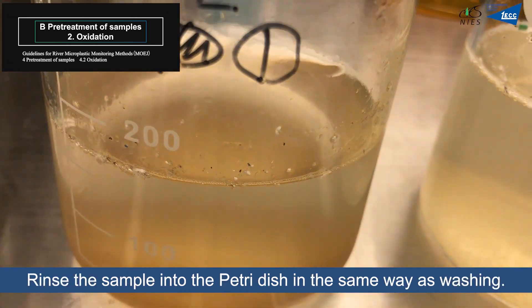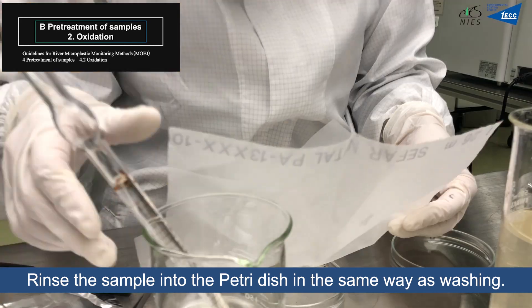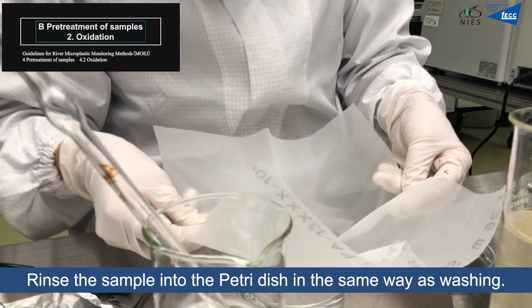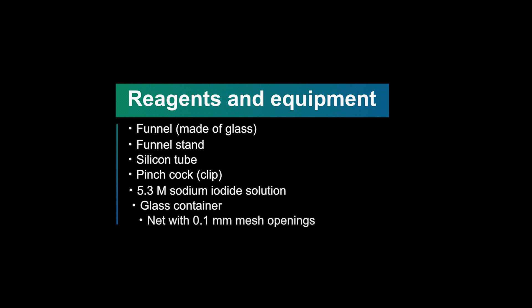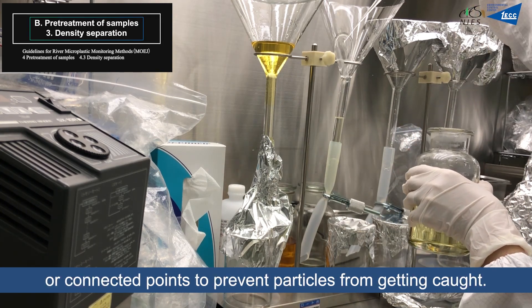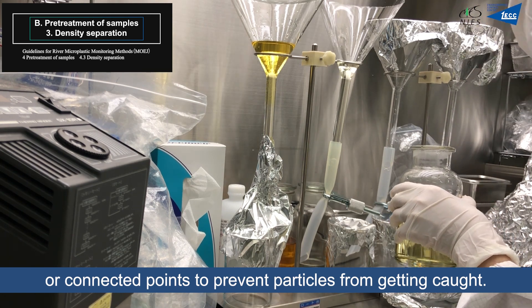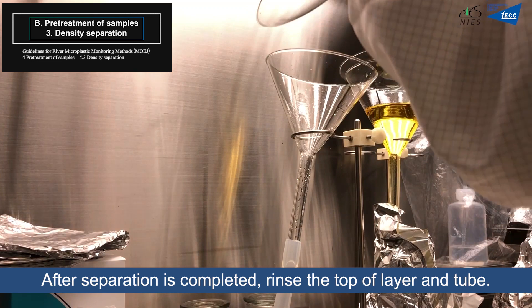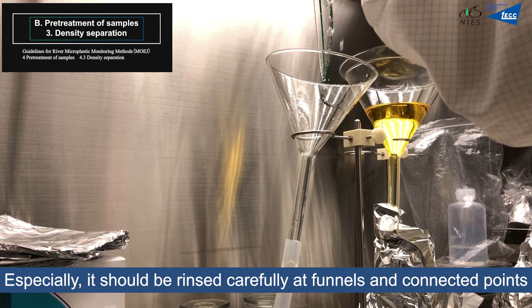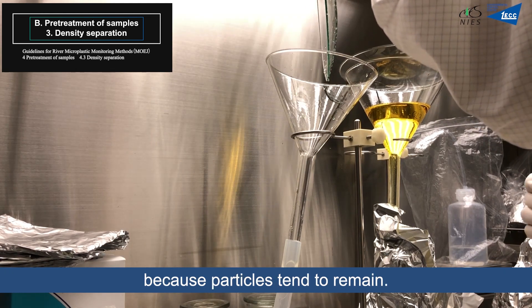Rinse the sample into a petri dish in the same manner as washing. When pouring heavy liquid into funnels, add the heavy liquid above the top of the tube or connection points to prevent particles from becoming trapped. After separation is completed, rinse the top layer and tube. Particular care should be taken at funnels and connection points, as particles tend to remain there.